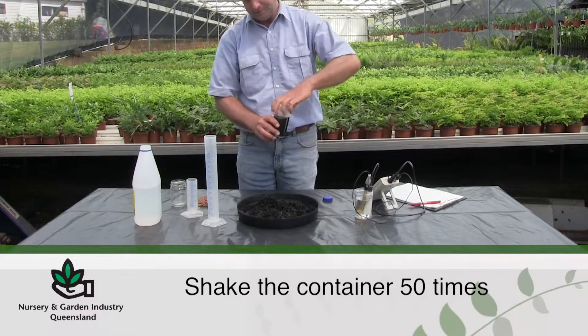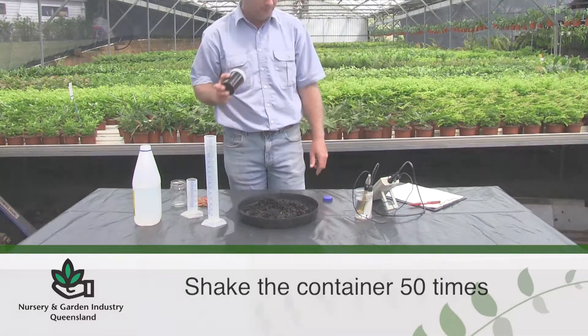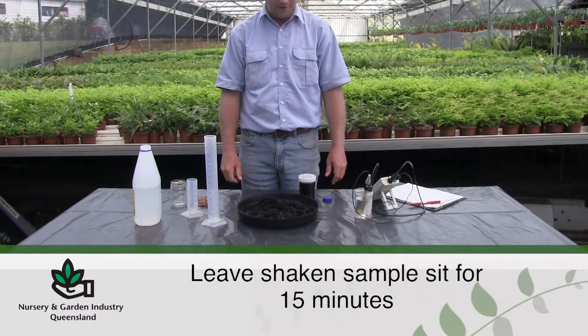After putting on the lid, shake the container 50 times. Leave the shaken sample sit for 15 minutes, then shake another 50 times.